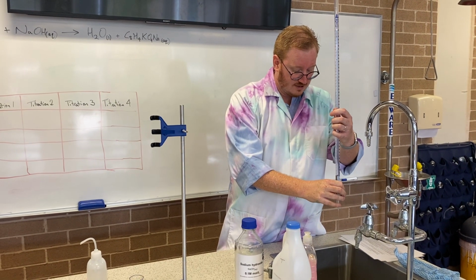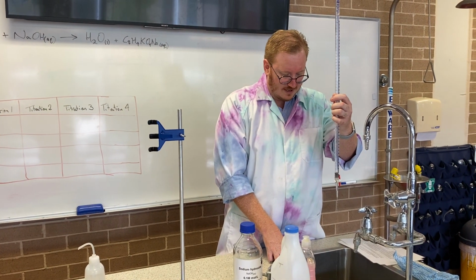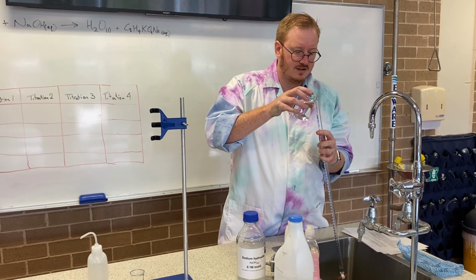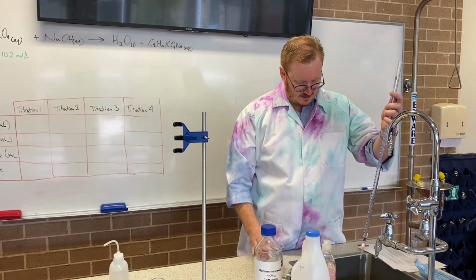Okay, so this is the sodium hydroxide solution. It's all good going down the sink too, it's very dilute. I'll make sure I run some water through there when I'm done. I'll give 2 rinses of that as well. I know this seems a little bit tedious, but there's reasons why we do it. All right.